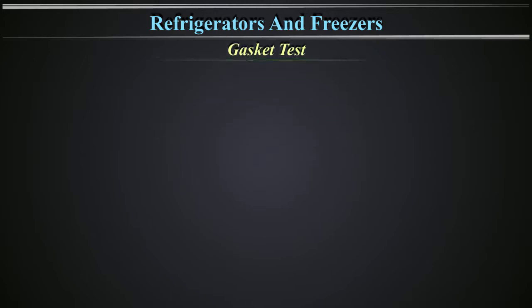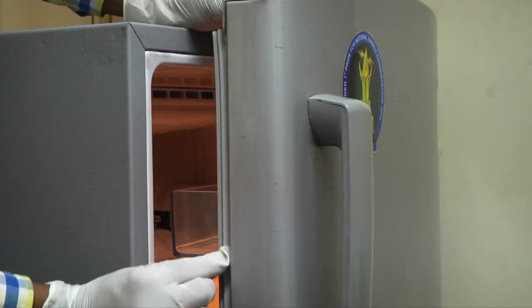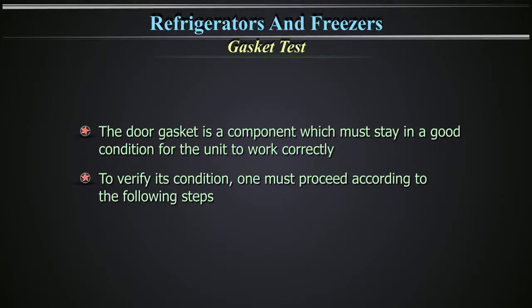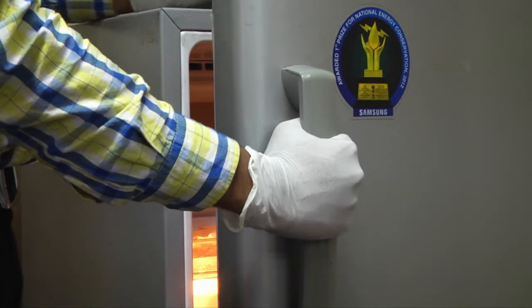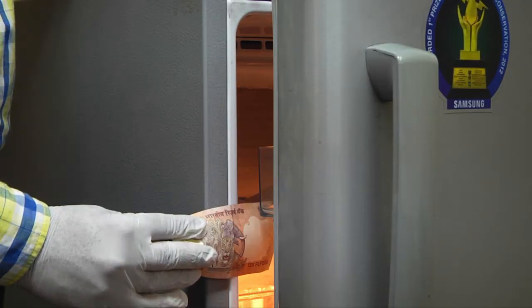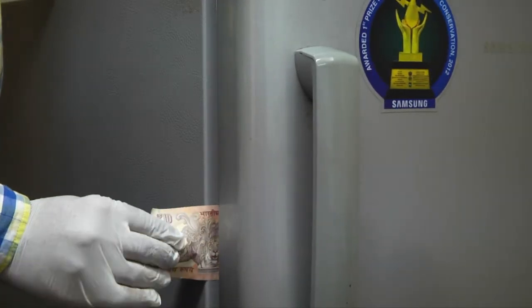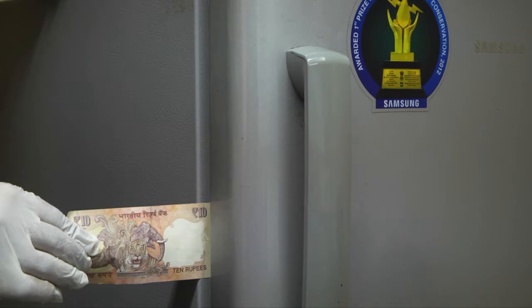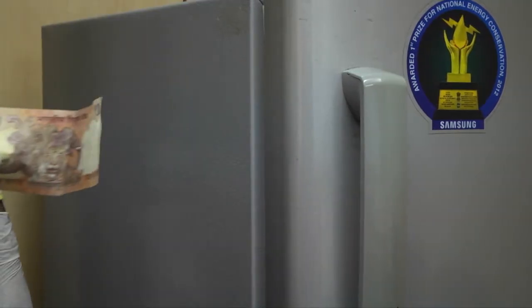The door gasket is a component which must stay in good condition for the unit to work correctly. To verify its condition, proceed as follows: 1. Open the door. 2. Insert a strip of paper of about 5 cm in width between the door gasket and the edge of the refrigerator's body where the gasket is housed. 3. Close the door. 4. Pull the paper gently from the exterior. The paper must put up resistance when being moved outwards. If the paper can be moved without resistance, the gasket must be substituted.